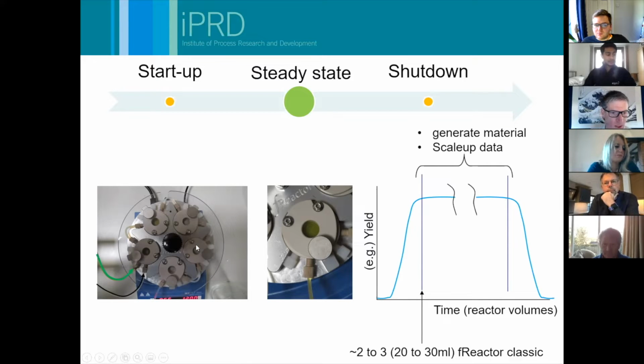Okay, and then I'm going to go into my, well, in this case, a physical transformation phase. So I would turn on my aqueous pump and I would turn on my oil pump, and you can see it takes a few minutes for our material to flow from the inlet to the outlet. You can see, I think, probably just in these two reactors, it's starting to turn green, whereas these are still clear. So we have this startup phase where our materials are coming together for the first time.